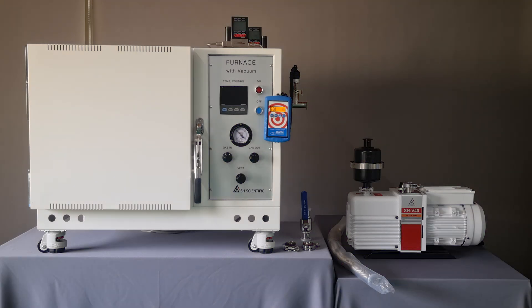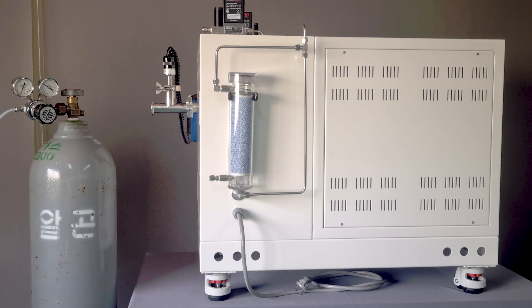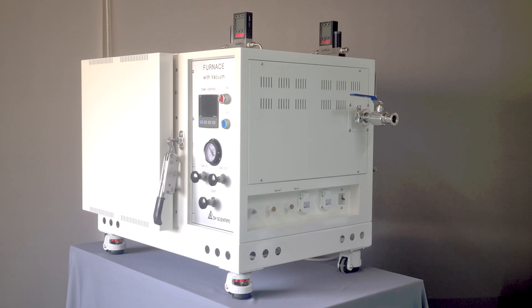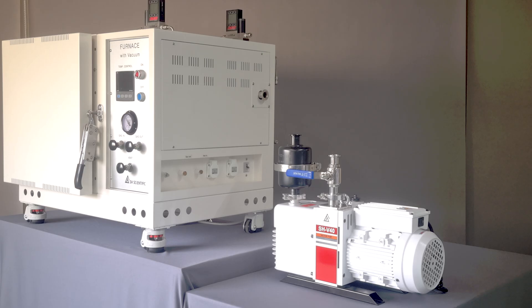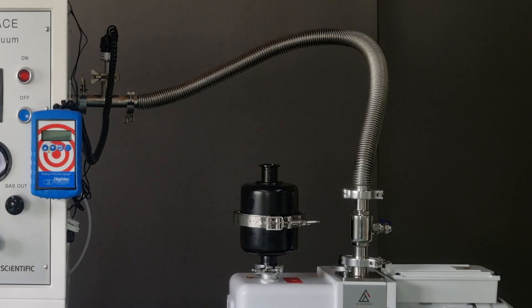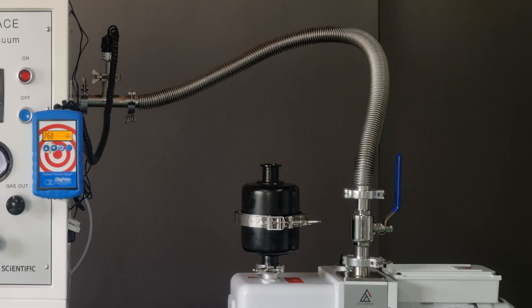Now, we'll explain how to connect the vacuum pump, get gas flowing, and operate the furnace. First, connect your gas tank to the gas in port with a quarter-inch hose. Then, install the KF25 flange ball valve at the vacuum port of the furnace or at the intake port of the vacuum pump. Next, go ahead and connect the vacuum hose. When you order a pump, the valve and hose are included in the package.